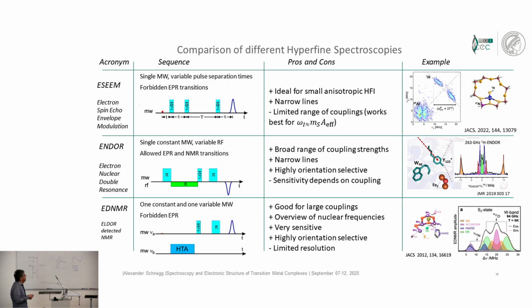It is also very widely used as a two-dimensional technique, which is called HYSCORE. Here's a very nice example of a HYSCORE experiment on copper, where the hyperfine coupling of this hydride was determined.